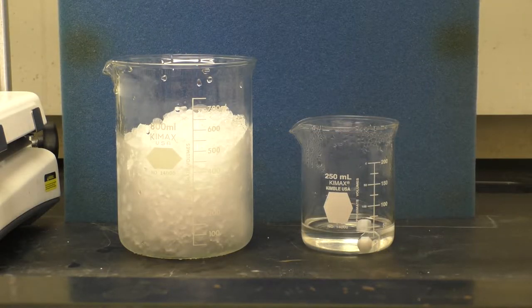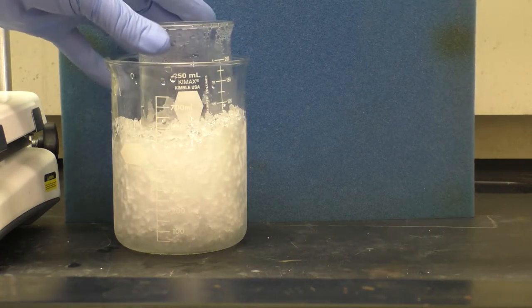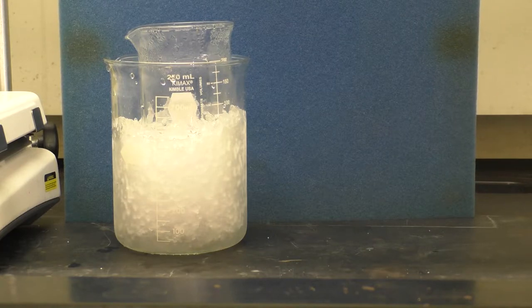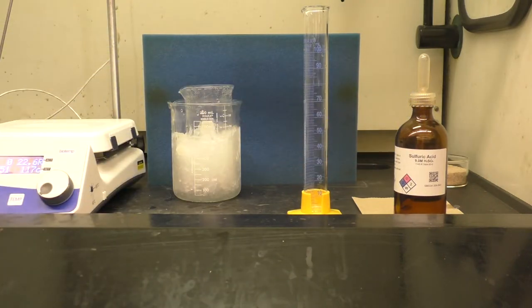Now that the reaction has cooled a little bit, we can now place it in an ice bath. And we'll let this chill further before adding the 9 molar sulfuric acid. Now we'll measure out approximately 50 milliliters of 9 molar sulfuric acid. Now, a slight change in the procedure, 9 molar sulfuric acid being used instead of 8 molar sulfuric acid. It really doesn't make any difference. It's just we happen to have 9 molar sulfuric acid already made up in the stockroom, and so there was no need to make up a separate bottle just simply to have 8 molar sulfuric acid.